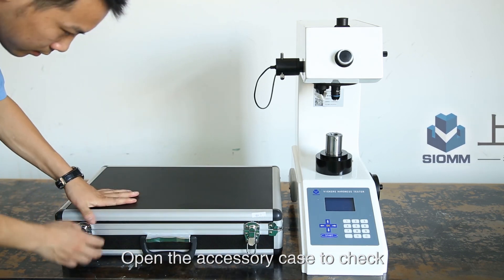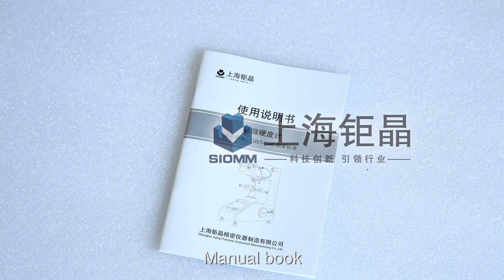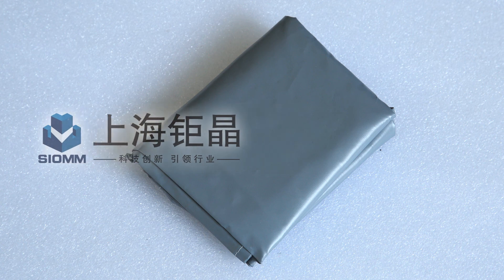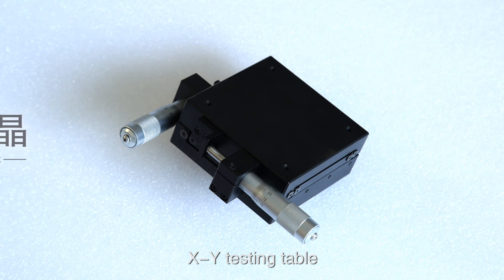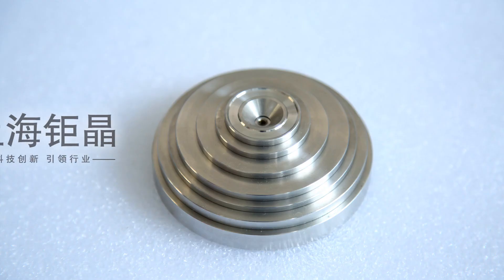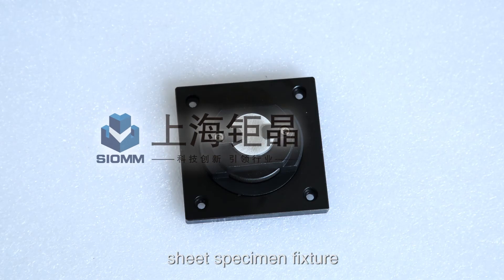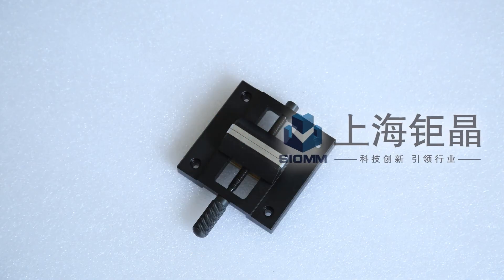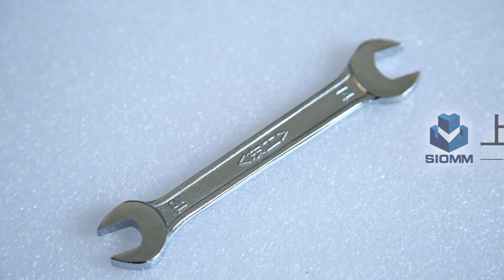Open the accessory case to check its contents: Manual Book, Dust Cover, Micrometer Eyepiece, XY Testing Table, Weight, Hardness Block, Sheet Specimen Fixture, and Flat Fixture.